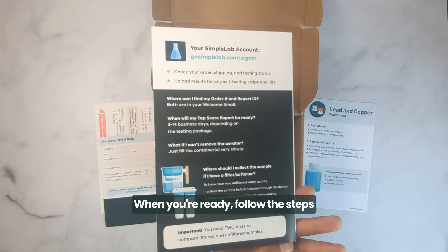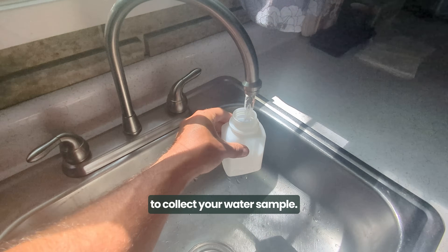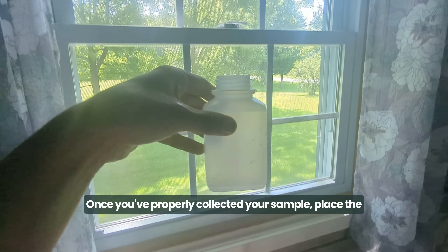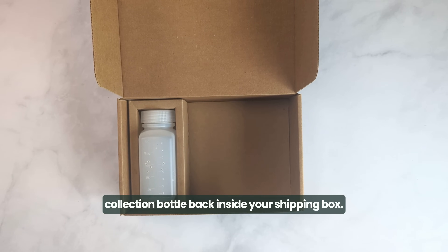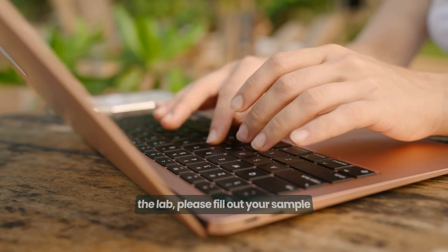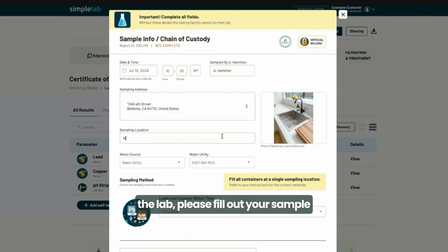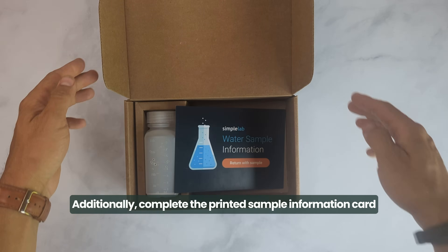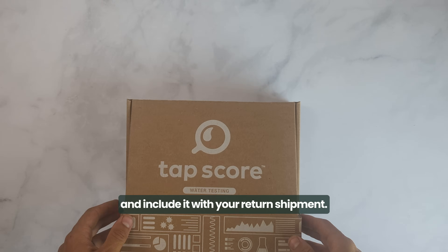When you're ready, follow the steps to collect your water sample. Once you've properly collected your sample, place the collection bottle back inside your shipping box. To ensure the most timely processing at the lab, please fill out your sample information in your online account. Additionally, complete the printed sample information card and include it with your return shipment.